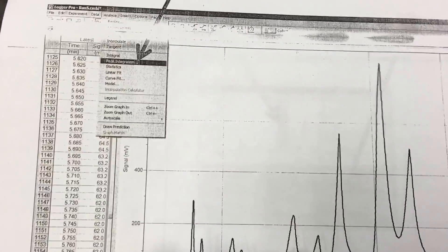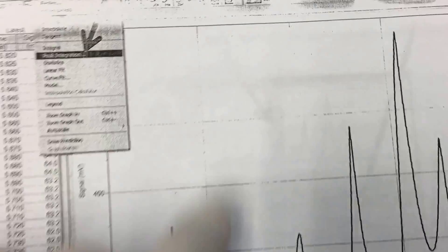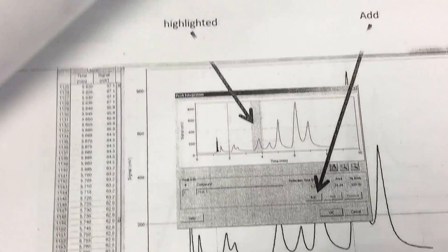You can differentiate the peaks in the GC Logger Pro program. Under analysis, the peak integration tool allows you to highlight the retention time and integrate various things.